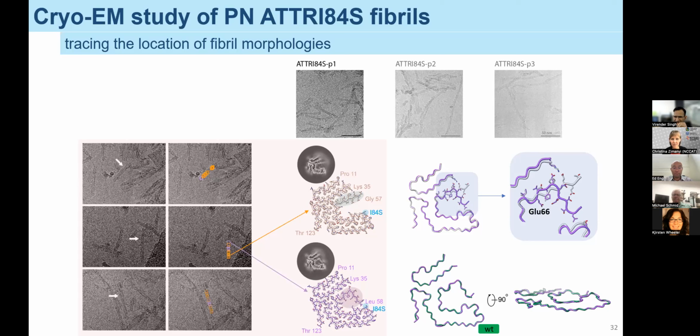If you see the fibril in this manner, normally if we try to cover it with overlapping segments, we are actually missing out, because this might be over-representing or merging, and not allowing the isolation of this kind of classes. But if we isolate each single layer and then do 3D classification, in those cases we are successful in getting a separate class.